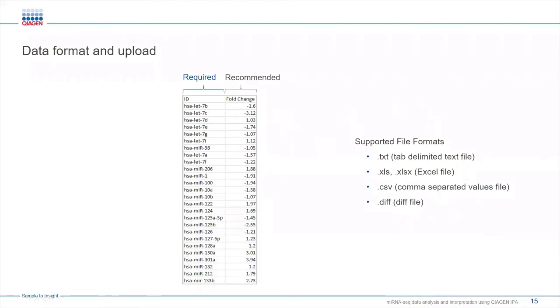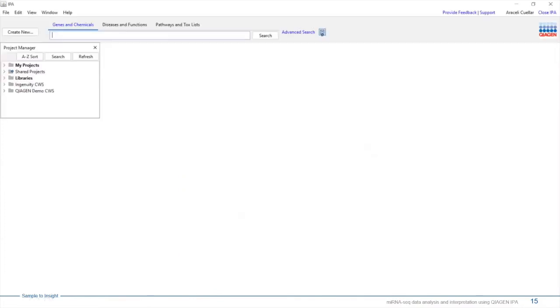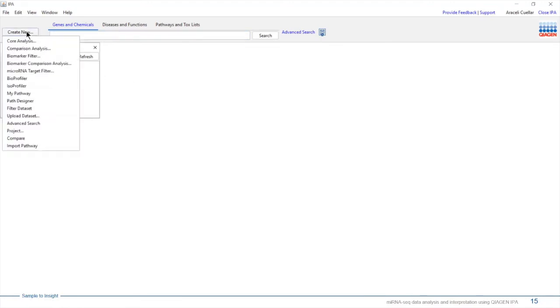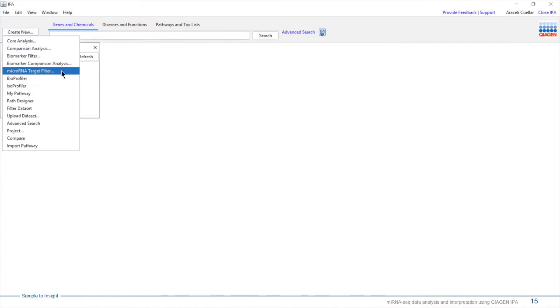With this, I'm going to go ahead and go into the software. To upload your dataset and start the analysis, we're going to go ahead and go into Create New, and then select microRNA target filter.